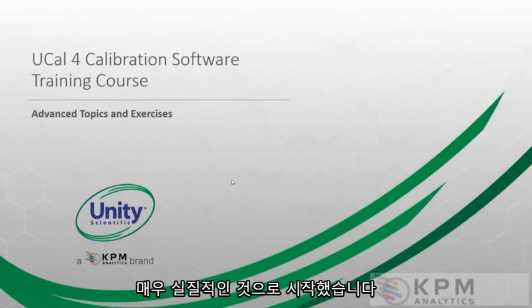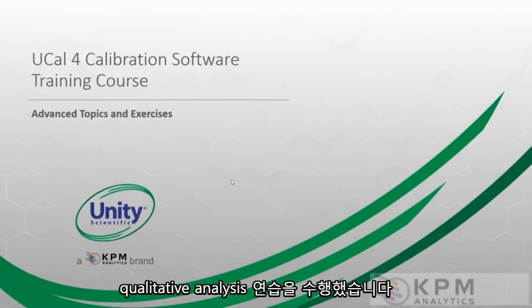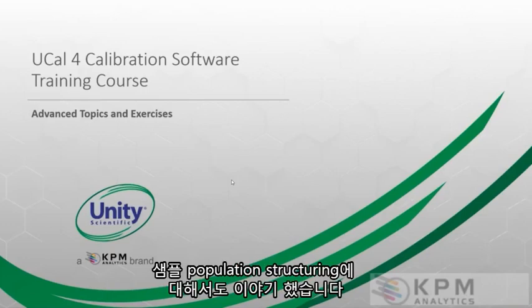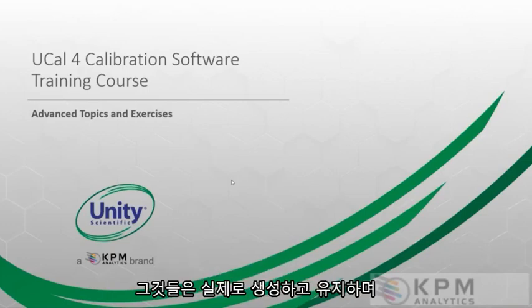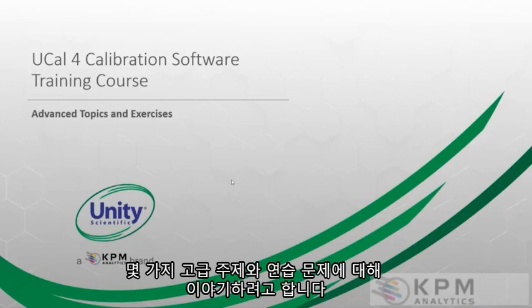We started out with the very practical: moving data around, managing samples, managing constituents, graphics, things like that. Then we did some regressions and some qualitative analysis exercises. And we also talked about advanced sample selection or population structuring. So those are really the nuggets of creating and maintaining an IR calibration. In this presentation, I want to talk about some advanced topics and exercises.